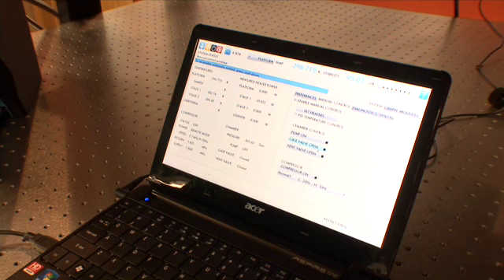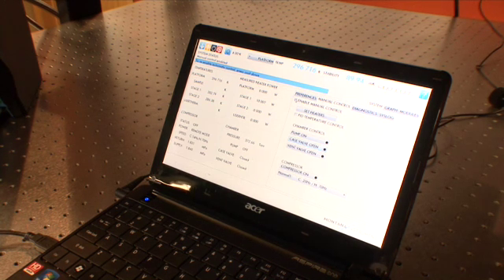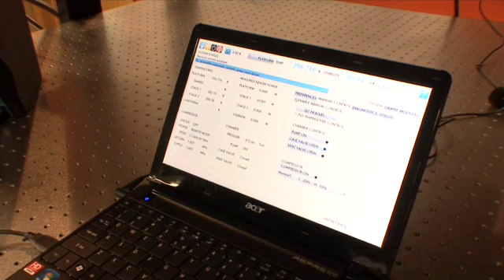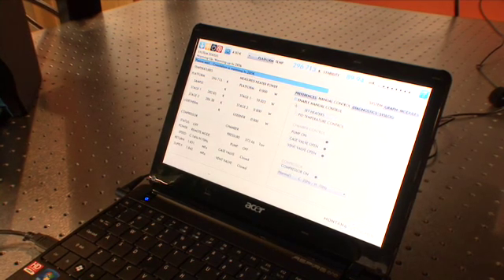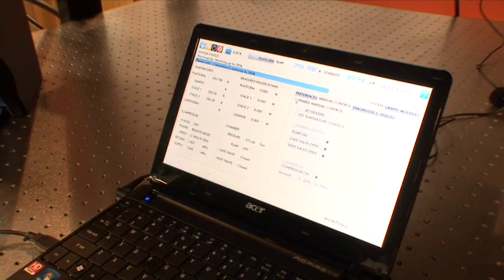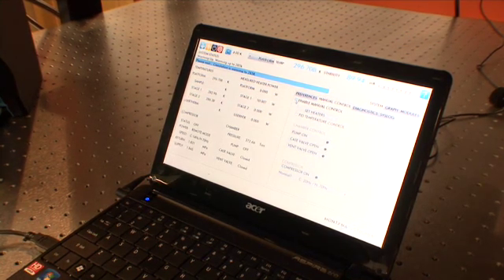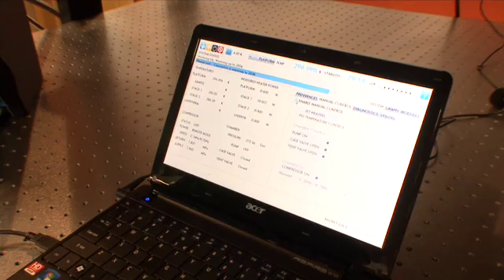This video shows what you can expect during your first cool down. Let us know if you have any questions or experienced anything different. Please contact us at Montana Instruments. We'd be happy to help you.